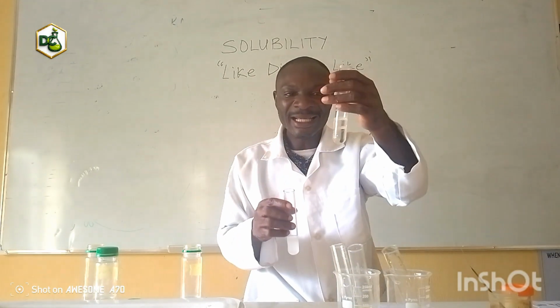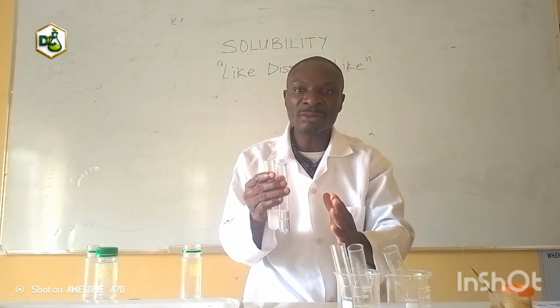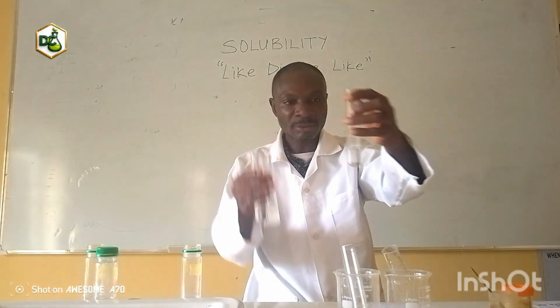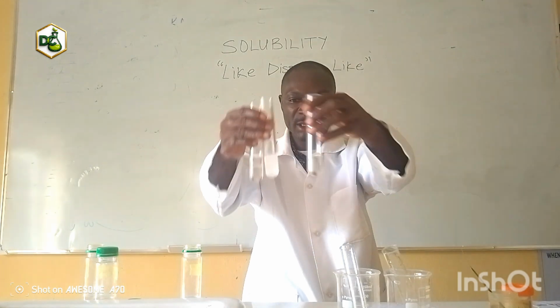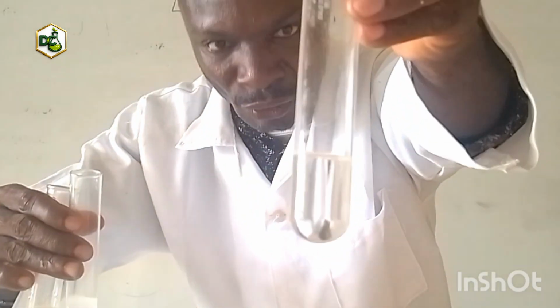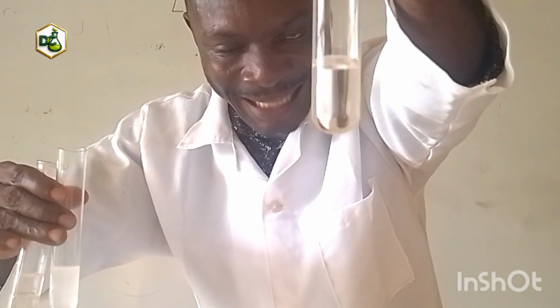Now let's look at a soluble condition, then sparingly soluble condition, and insoluble condition. Now you can see these three conditions. This is alcohol in water, soluble. You see a clear solution. There is no boundary formed, and it's not cloudy, so it's soluble.